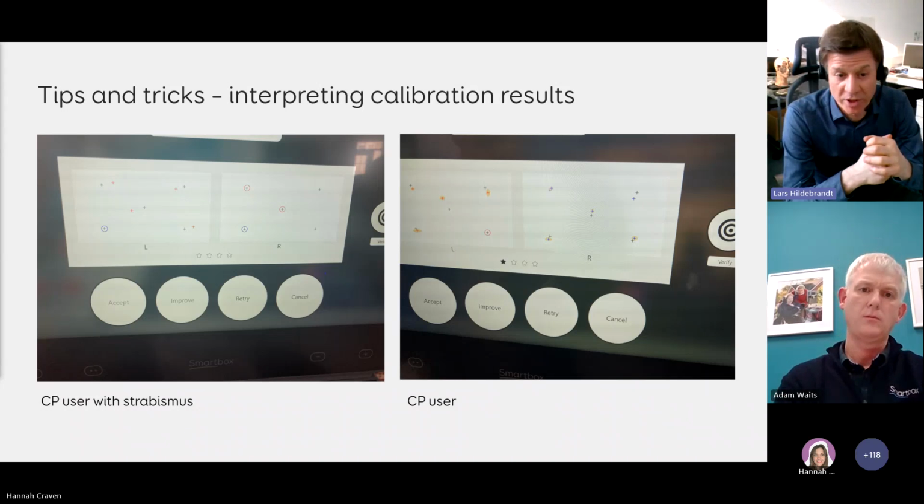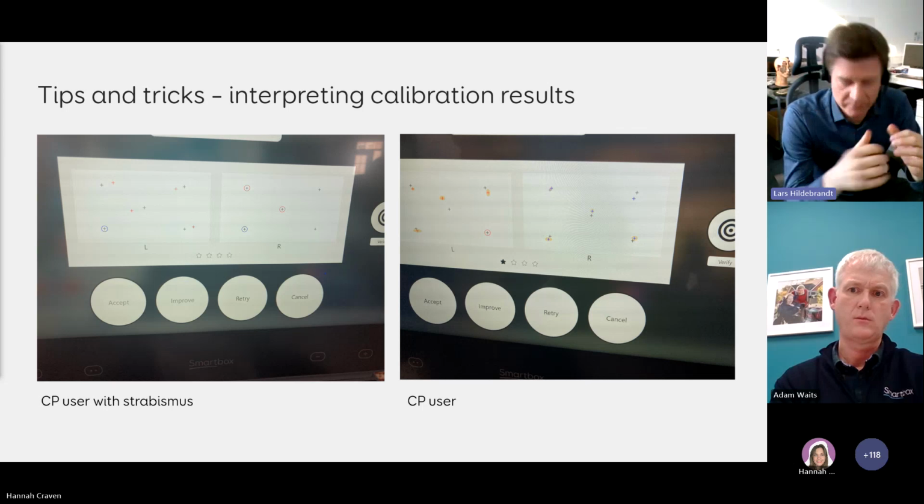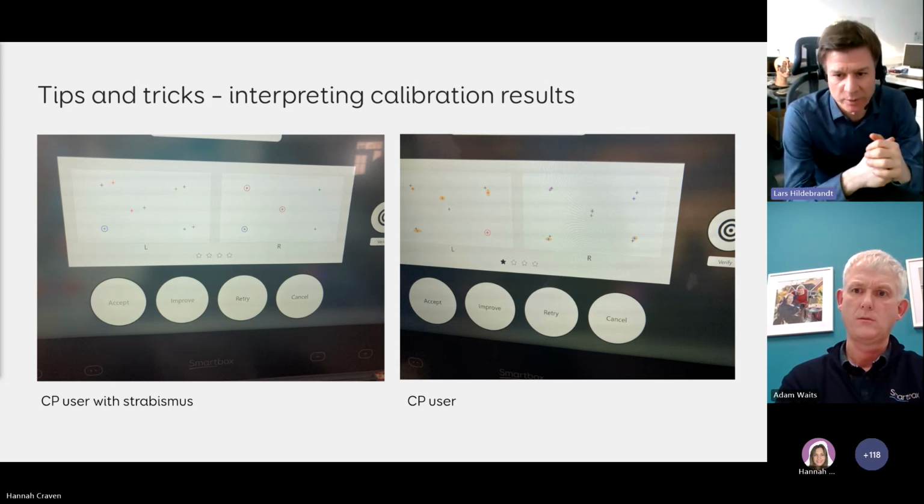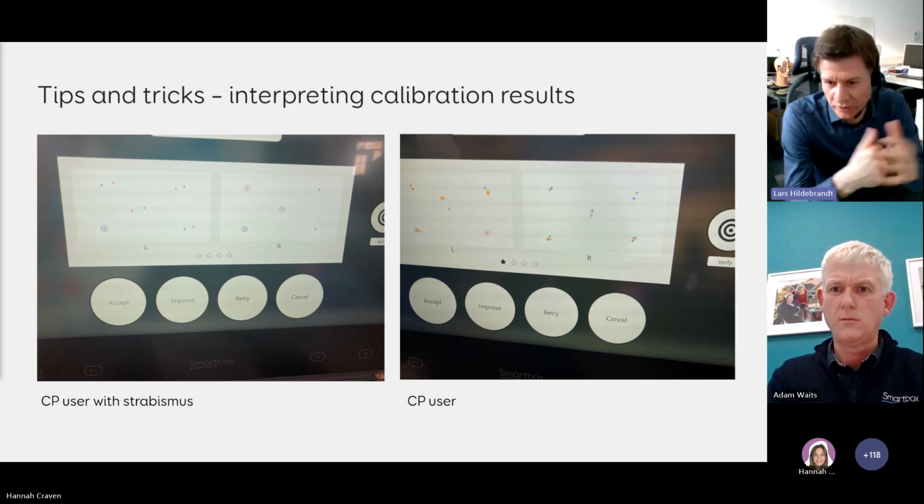However, the 1-point calibration is good enough for some applications where you don't have very small cells to start with. Don't overstress the user with complex calibrations if the easy ones will do it as well. It's good enough. Same is true for 0-point calibration.